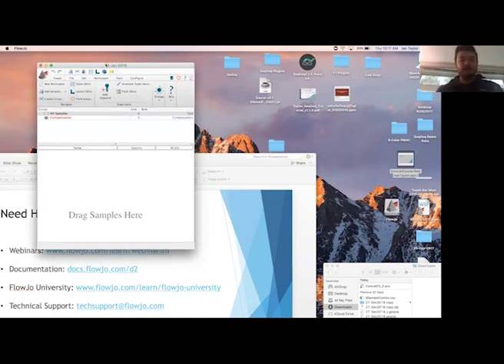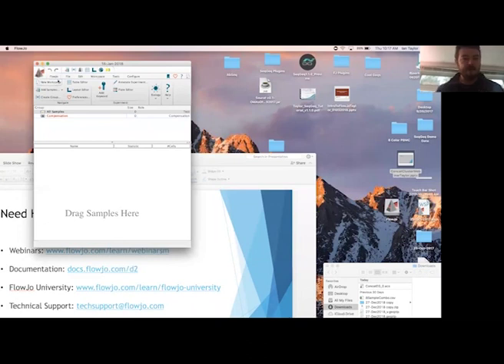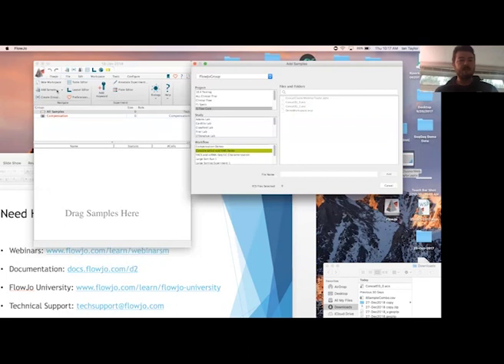So back to our workspace, I'm going to go ahead and load some data. And to do this, I'm actually going to use a new tool we have. It's the FlowJo Envoy vehicle here. And to access it, you would just click Add Samples and then choose the Envoy option there. You will have to have an Envoy account to do this, and you will have to have already loaded some data. So you can see in the FlowJo core, in my lab, we've already got a concatenation t-SNE demo data set here. Oh, excuse me.